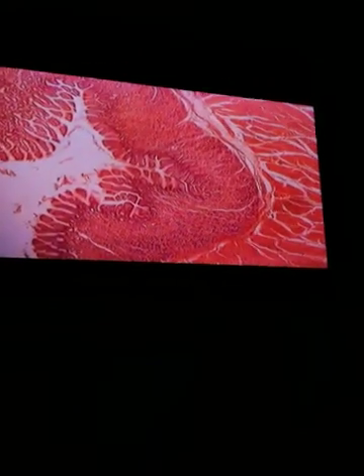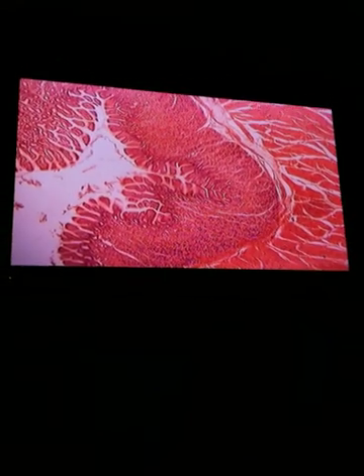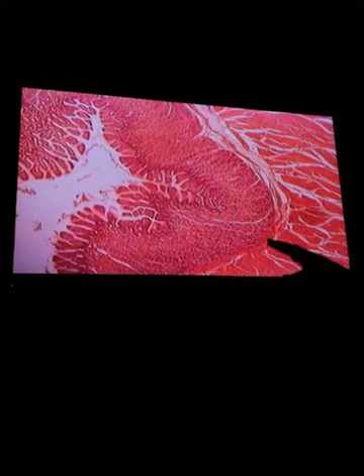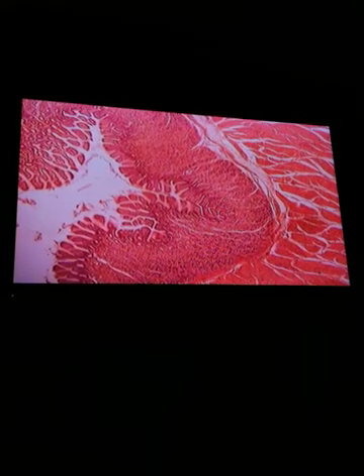Let me get over here. All right, so inside the stomach, as the esophageal sphincter opens up into the cardiac area of the stomach, which is a little bit away from the fundus, you're going to have all these rugae on the inside with your simple columnar, and then below it you have all the different muscle layers. As you work your way out, you can see the three different muscle layers. See how they go in different patterns and waves.